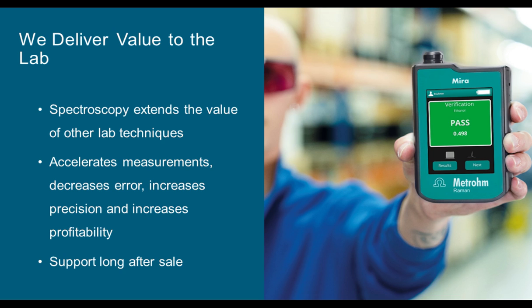And with spectroscopy, you could potentially do that much, much faster, either via some automated imaging or some very quick testing there at the point of care, just to make certain that you've gotten everything out.